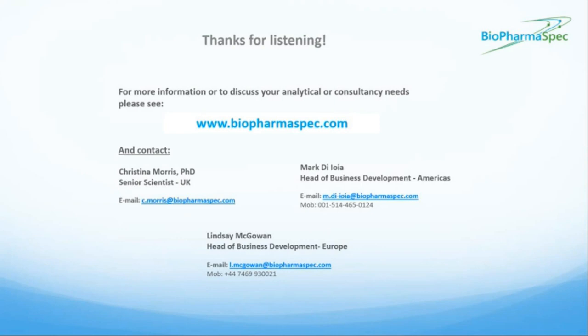Our next question, how many IDA runs do you find are necessary to produce a proper spectral library? I think that's based, to an extent, on the host cell type, maybe mammalian versus bacterial, for example. But I would say it's also dependent on the type of analysis that you're wanting to do.